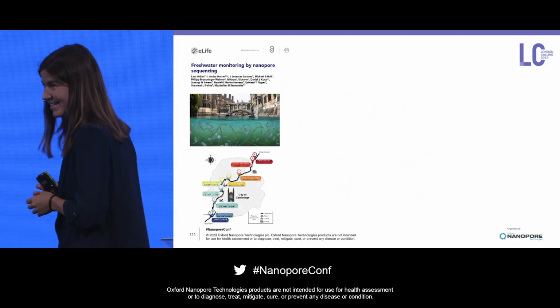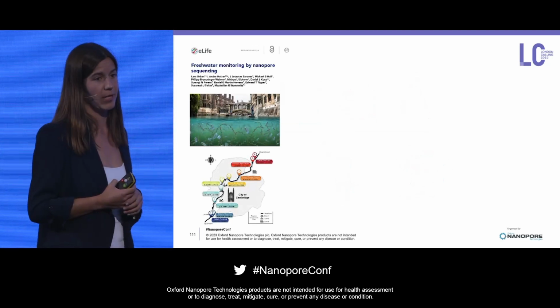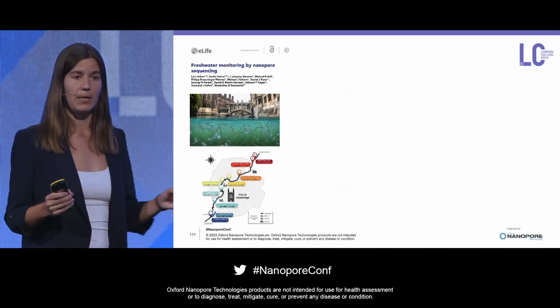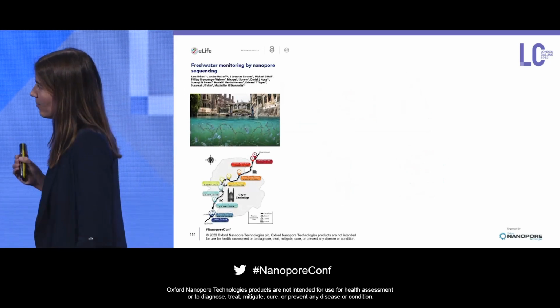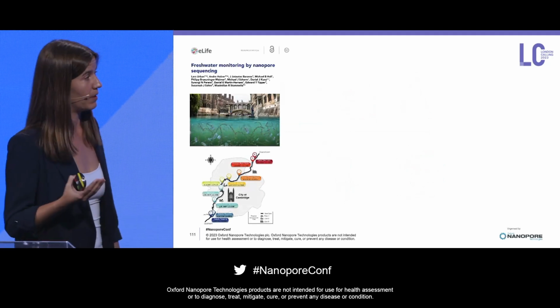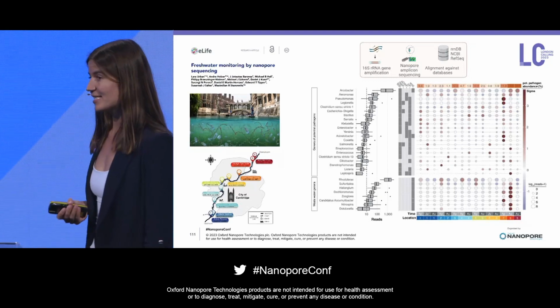In the very first study that I conducted with nanopore sequencing, which I still did next to my PhD in Cambridge, we established nanopore sequencing for freshwater monitoring and used our local river Cam in Cambridge as an example and sampled water at different time points, along a gradient of anthropogenic impact, ranging from upstream of the city, a quite natural habitat, throughout the city with really high pollution, at what you see here, location 7, for example, a huge anthropogenic impact, to the outlet of a sewage pipe from a nearby wastewater treatment plant.